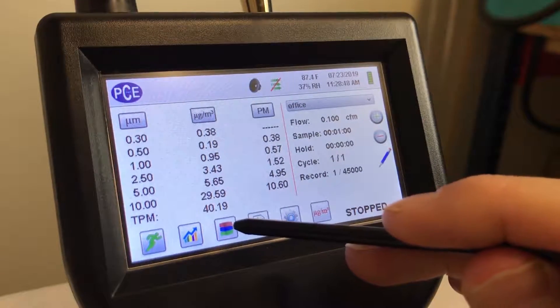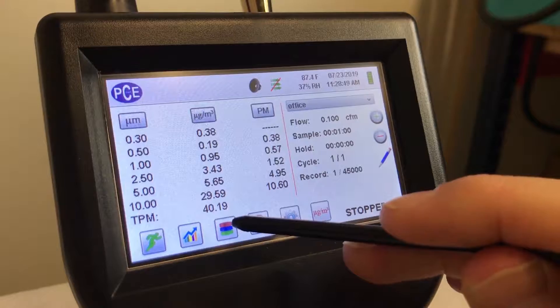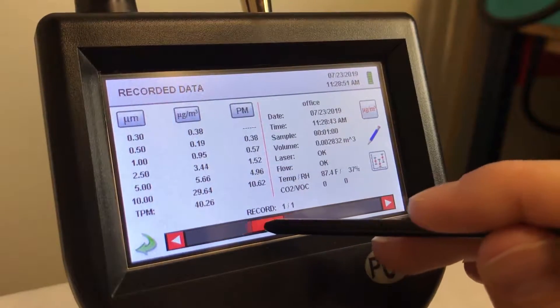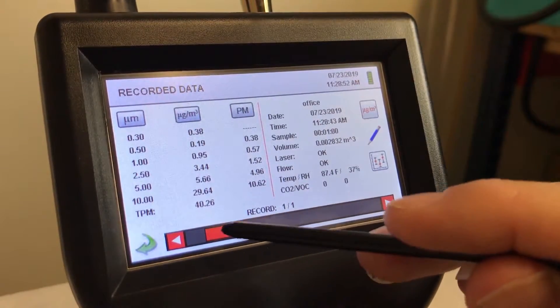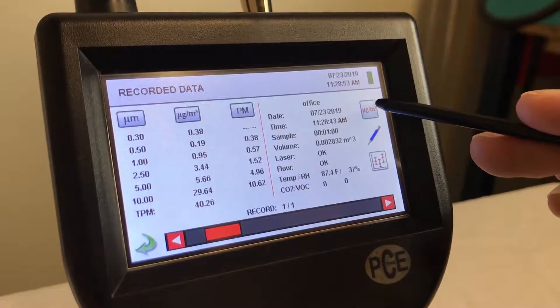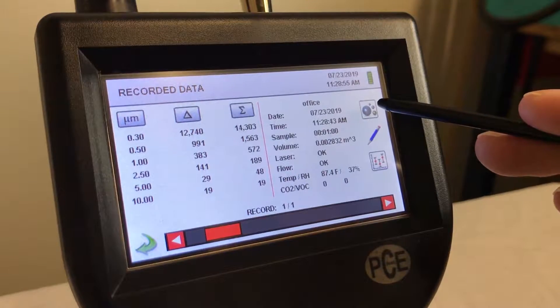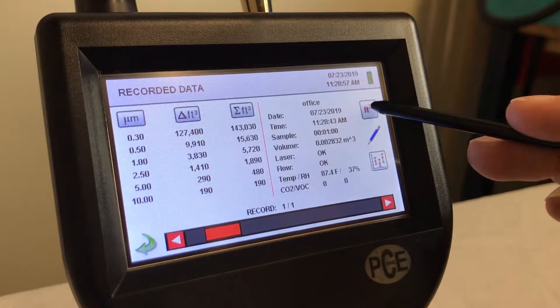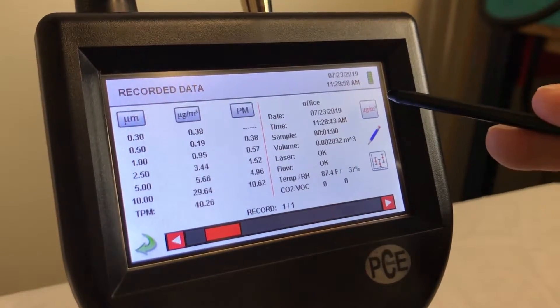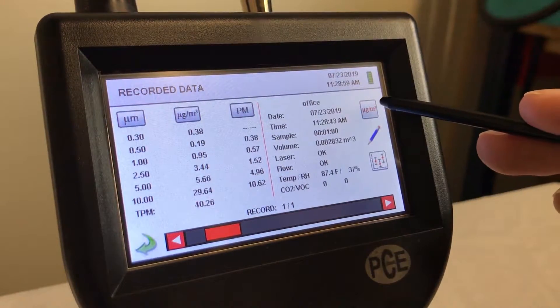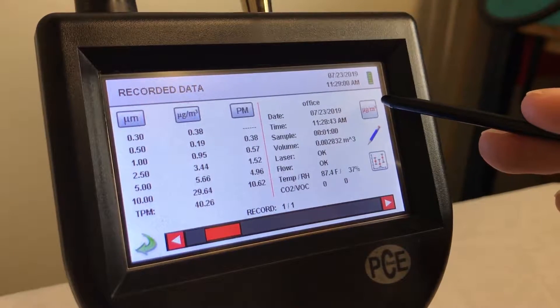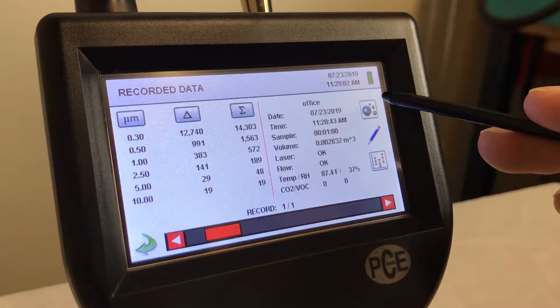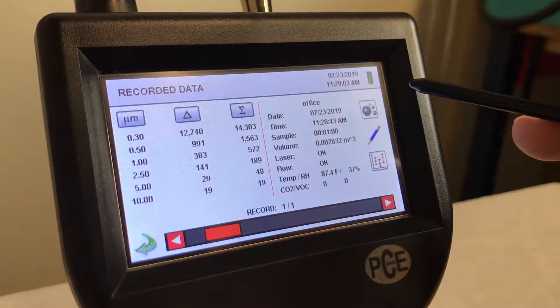If you want to see all the data, you can go back to this screen and see all your numbers: cubic feet, cubic meter, PM, and cumulative and differential.